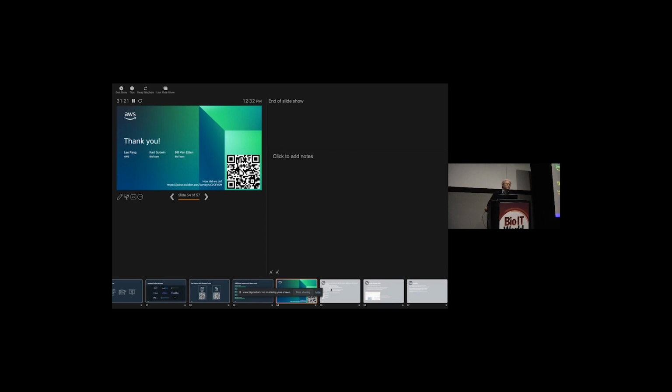It depends on which one. There are the ones that are based on open source. Yeah, they're out there. We put them up on our tutorials website. There is a set there that are proprietary, so they're published by our partners.